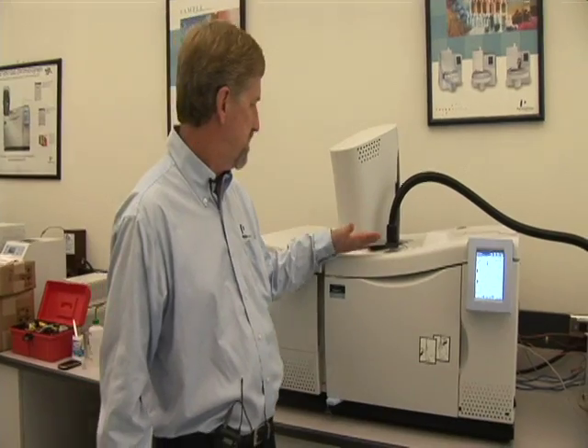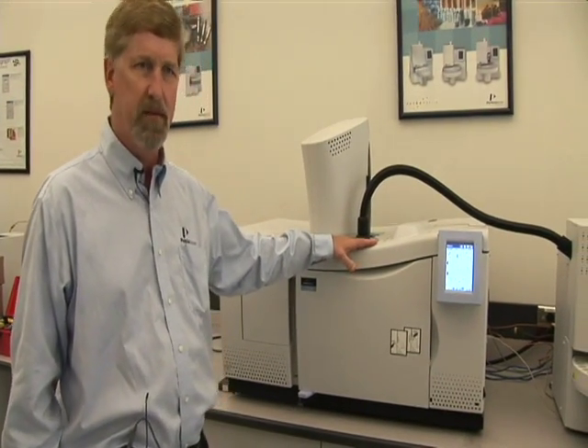What I'd like to introduce is our Claris 600 series GCMS. Atomic spectroscopy is the elemental analysis of many of the materials in the world around us.